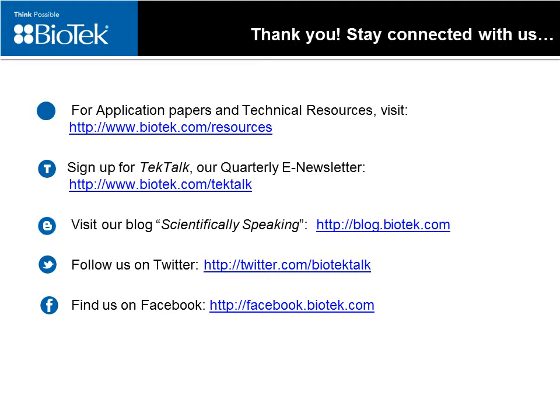I'd say the basic limitation is with cell types that tend to cluster. And of course, the same limitations in measuring those cells exist with alternative methods as well. So really the same limitations that you see with fluorescent-based approaches are present here, but it really works across a variety of cell types. And really the power is that you can optimize the analysis for each cell type.